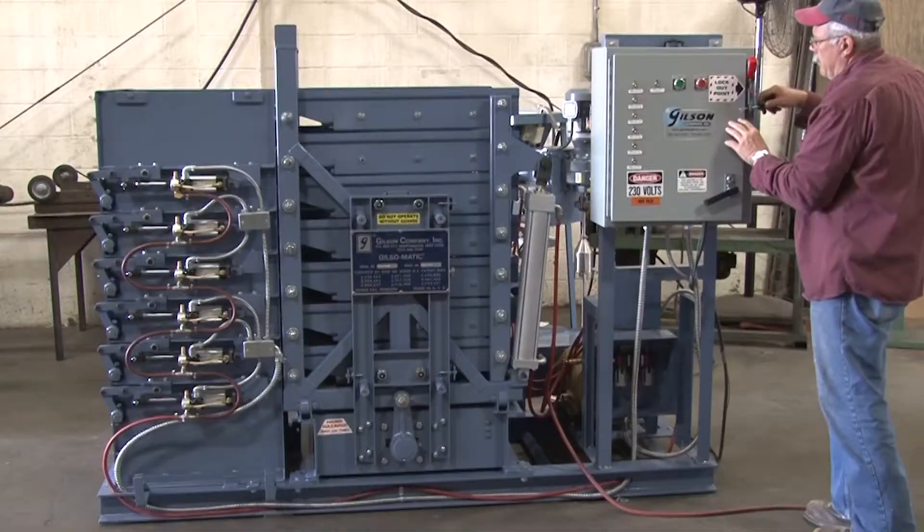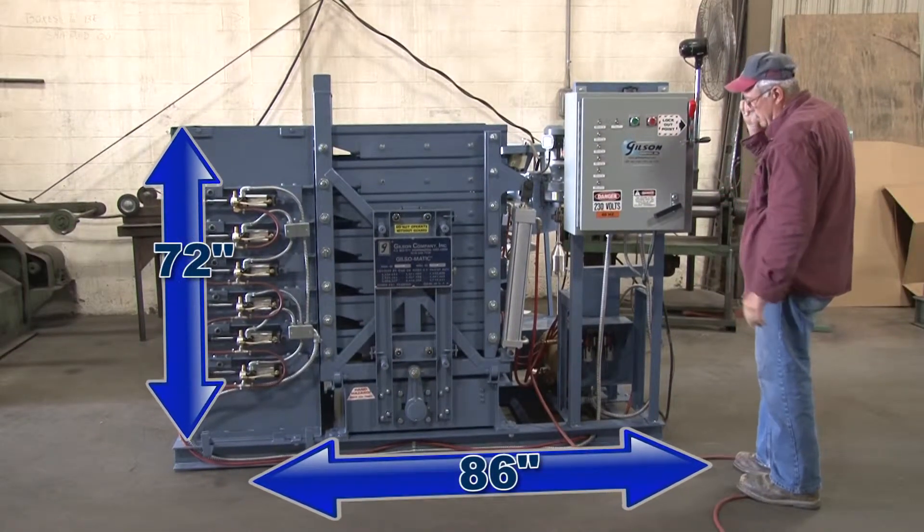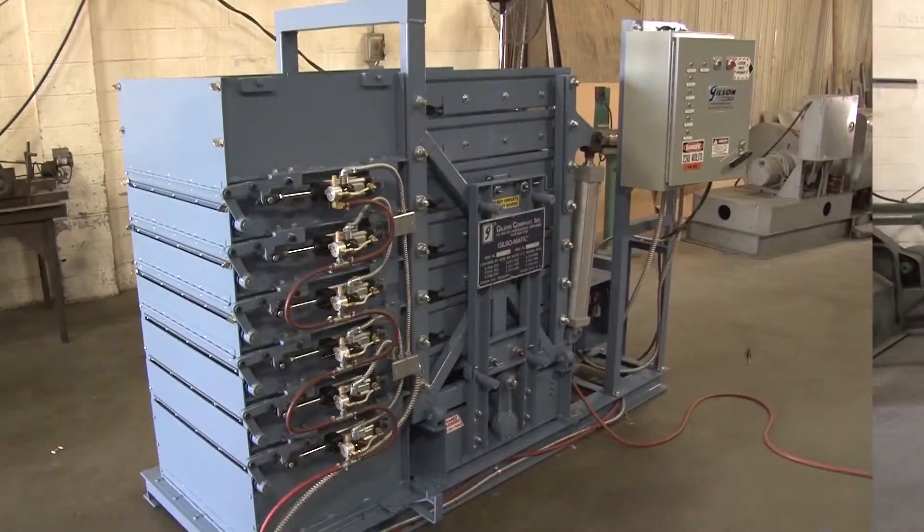The standard Gilsomatic with a 3-horsepower motor is uniquely designed to fit into most in-plant operations easily and conveniently.